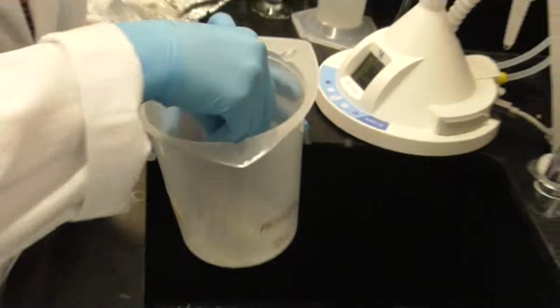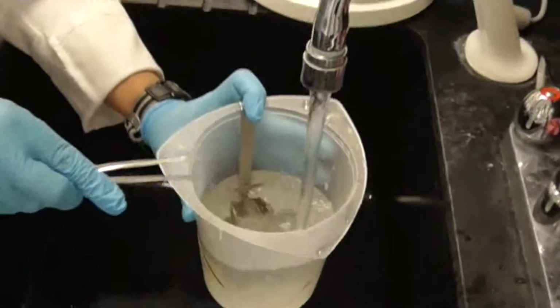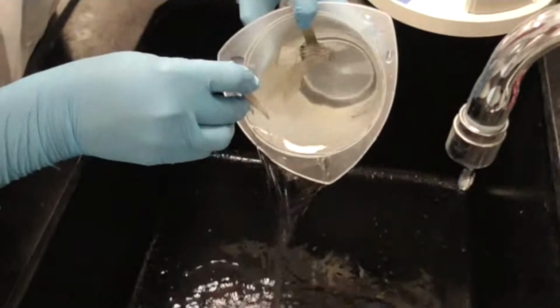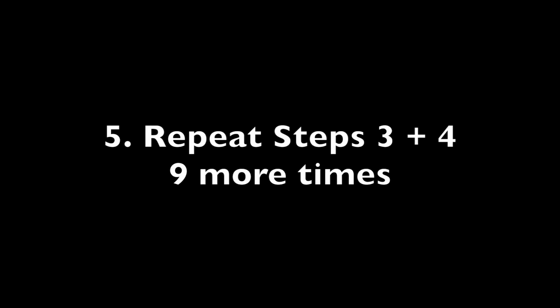Step 3, use the tap to completely fill the container with water. Step 4, drain out all of the water that you just added, again without dropping the cover slips or device. Repeat those last 2 steps 9 more times so that you have filled up and dumped out the water from the container 10 times in total.